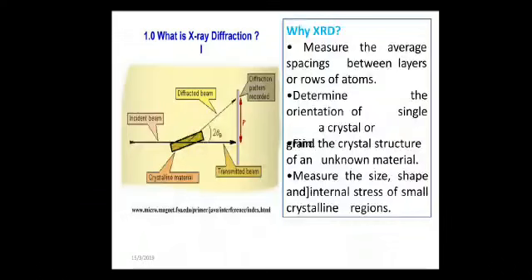These re-emitted wave fields interfere with each other, either constructively or destructively. That is, overlapping waves either add up together to produce stronger peaks or cancel each other to some degree, producing a diffraction pattern on a detector. The resulting wave interference pattern is the basis of diffraction analysis. This analysis is called Bragg's diffraction.